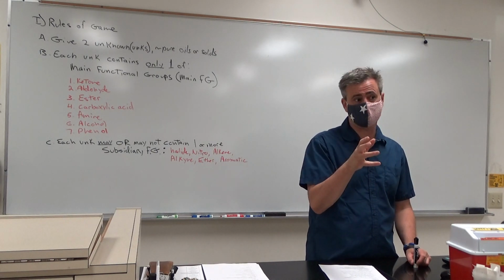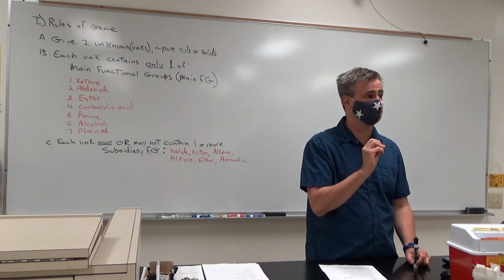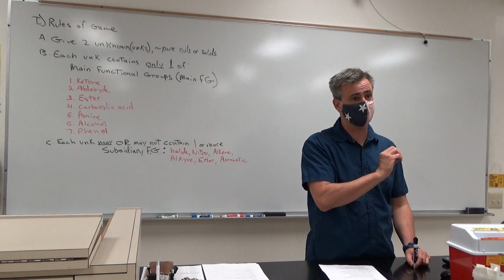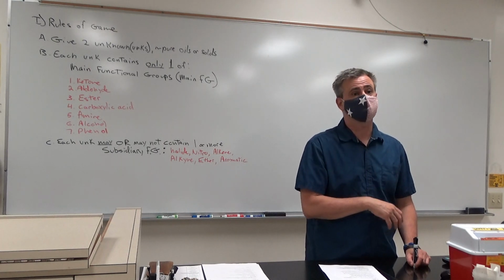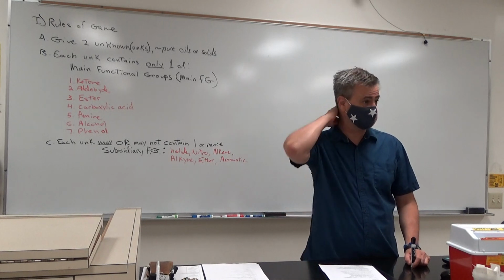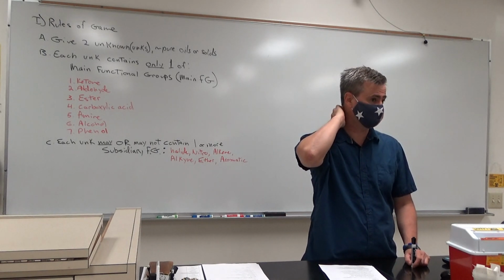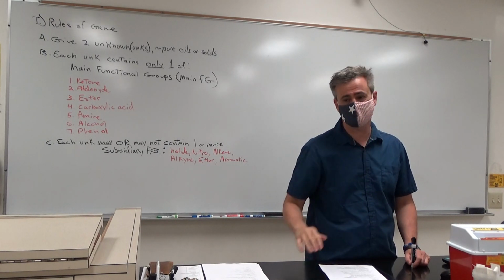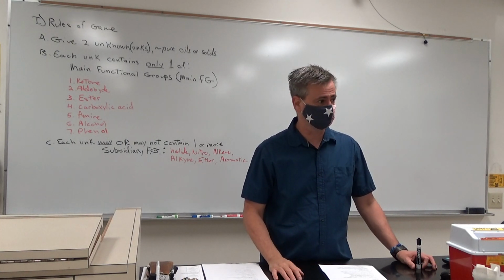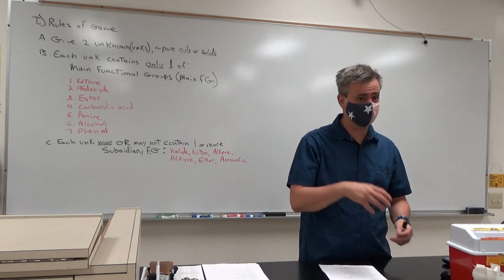A ketone has a very distinctive carbon signal in the carbon NMR, right up around 200. So that's something you really want to see if you think you have a ketone or an aldehyde. They're in the same region, a little bit shifted, but same basic region. So these things all sort of feed into each other.